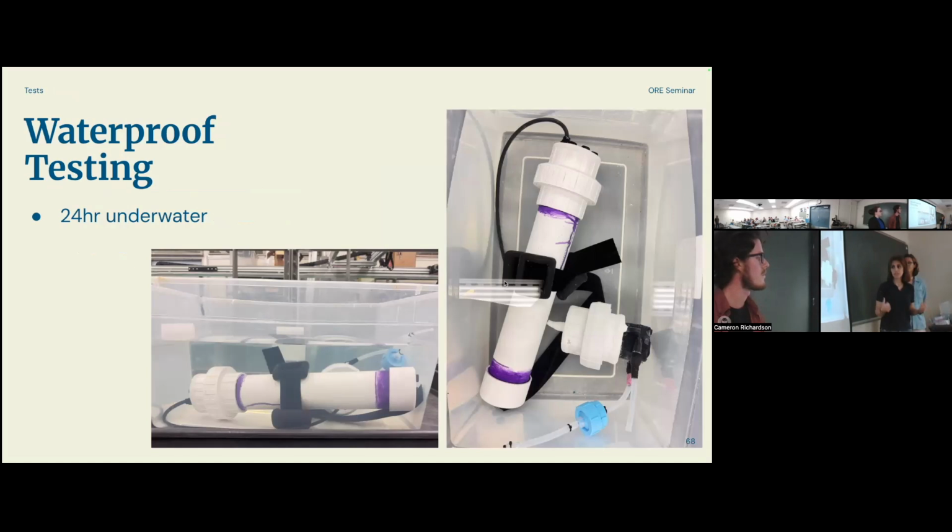So after getting this result, we put it all packaged into the water for 24 hours, and after 24 hours, we didn't have any water inside of the union.